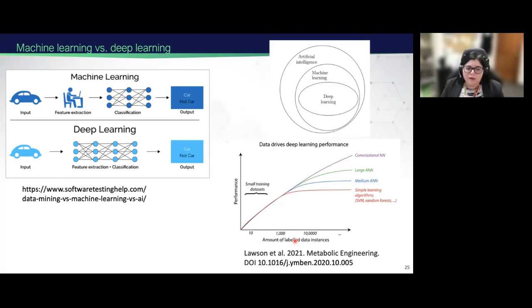In the first version of PeakDecoder, we needed to design it: okay, we will use the retention time, peak width, the mobility difference, the fragmentation pattern. So we are encoding all these features to tell the model what the important metrics are. But using deep learning, the model will learn how to extract those by itself. And the more data we have, the more the model is able to discriminate and capture that complexity.